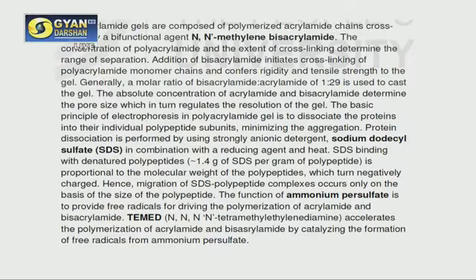Then what do you have to add? You have to dissociate the proteins. You have to denature the proteins. Before you load them in this gel, you have to denature the protein, and for that you have to use an anionic detergent, that is sodium dodecyl sulfate. Like in DNA, you used a cationic detergent, that is CTAB. Here you are using an anionic detergent, that is SDS.